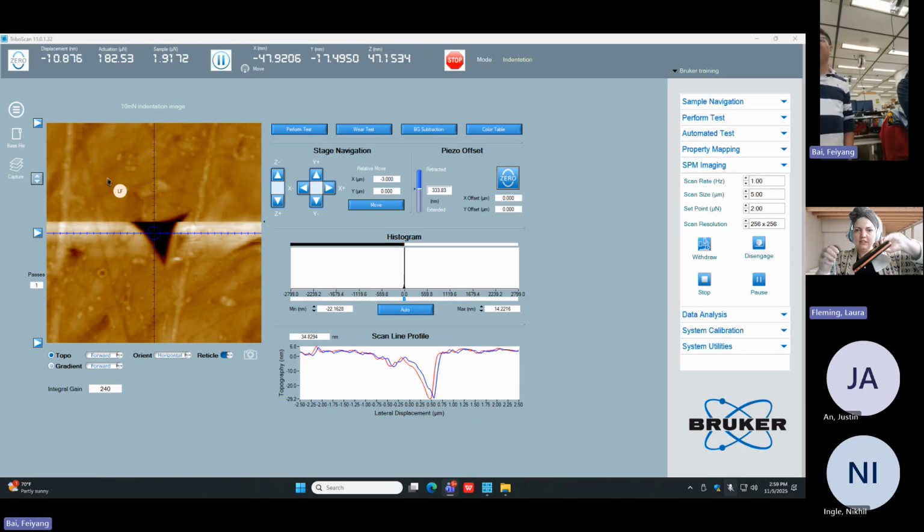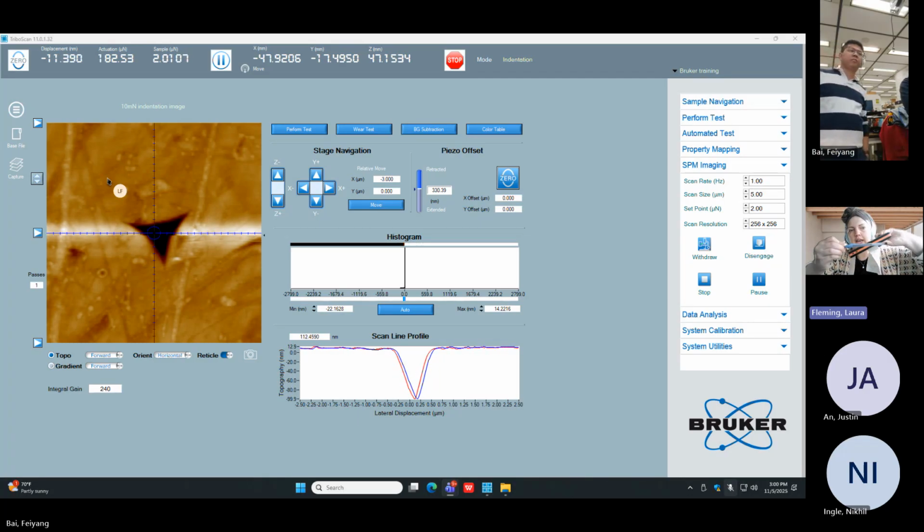Now, all of a sudden, that's kind of triangular. Your average plane goes from here to here to also including here. That means that that average no longer is between these two points, but it's down here. So the average color is somewhere between this bottom point and the sample surface color, which means that when it traces here, this is now artificially conflated as higher than the average. So it's really just an impact of the background subtraction and how it operates.